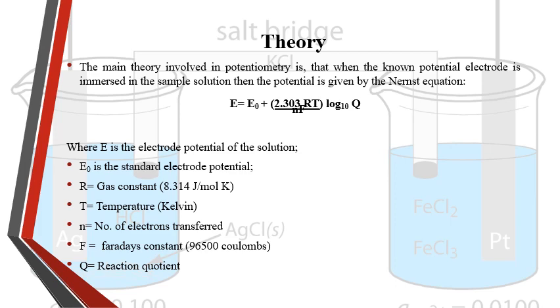The temperature affects the movement of ions in solution, and therefore the potential measured.